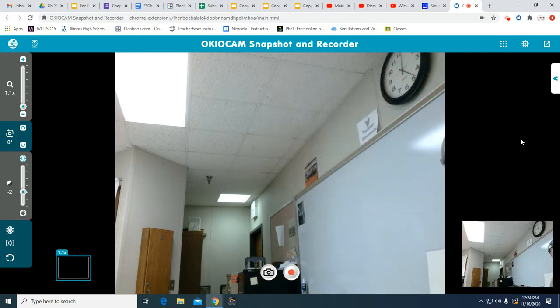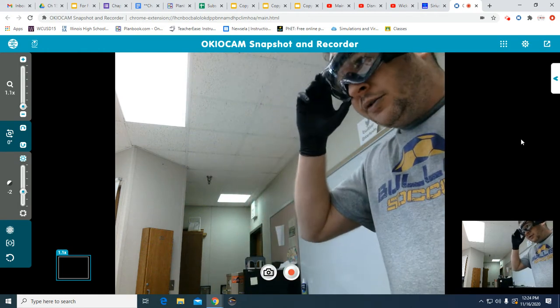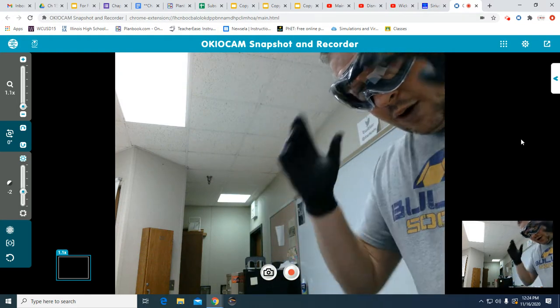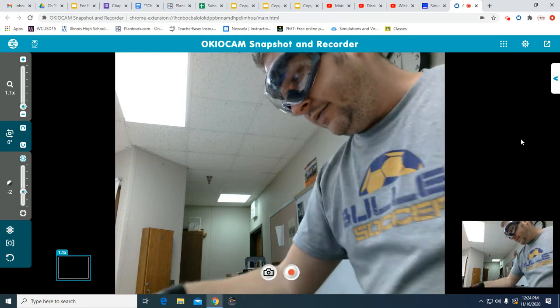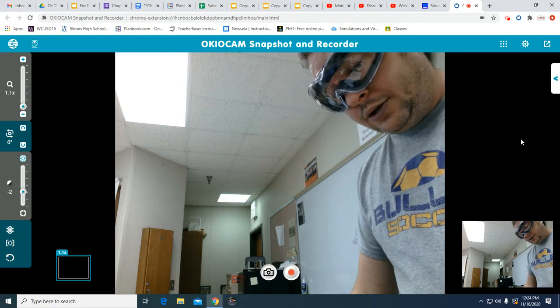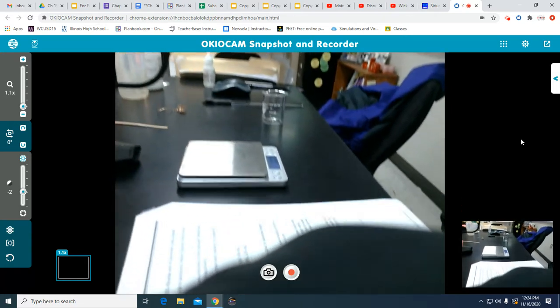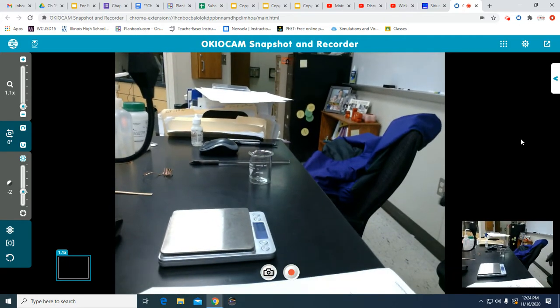Anyway, let's start off with number 1. I don't want to sit down doing this. So, goggles on. Ready. All right. We are going to obtain a clean and dry 50 ml beaker, okay? 50 ml beaker, right there. All right, we are then going to turn our balance on. There it is. If I can get my camera to stay. All right.